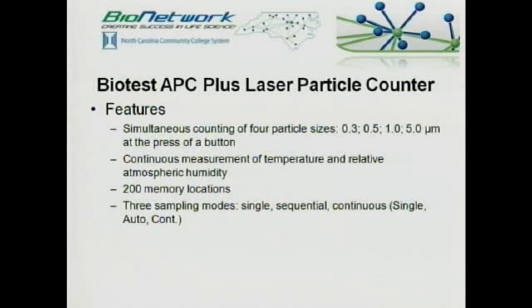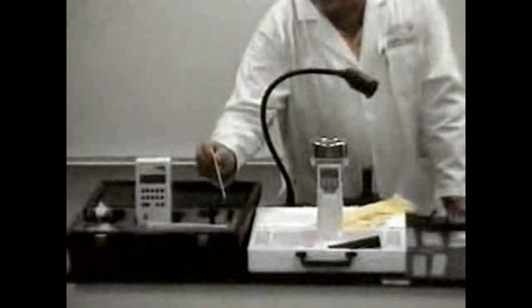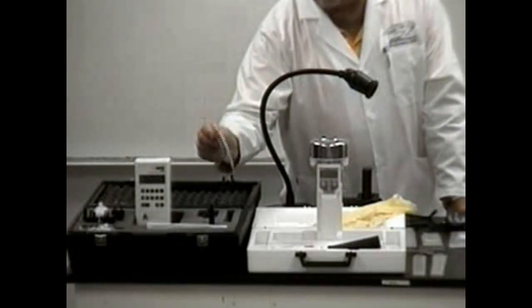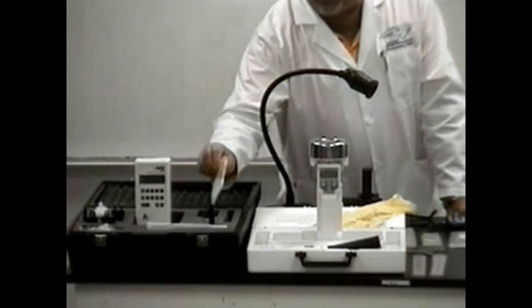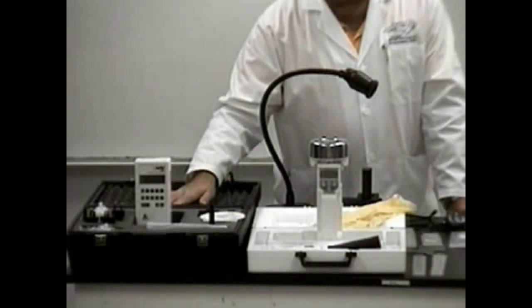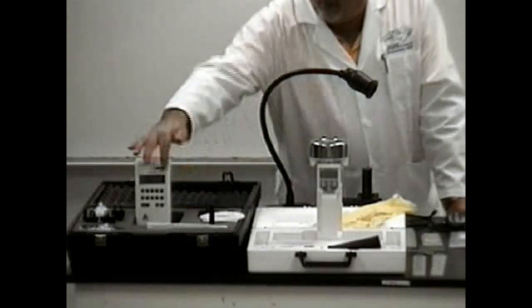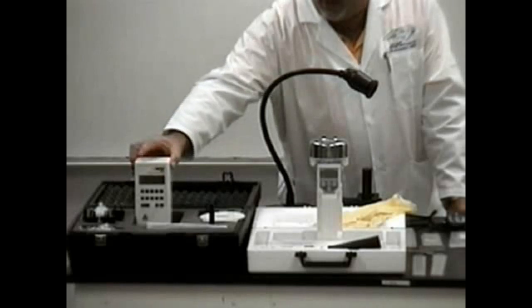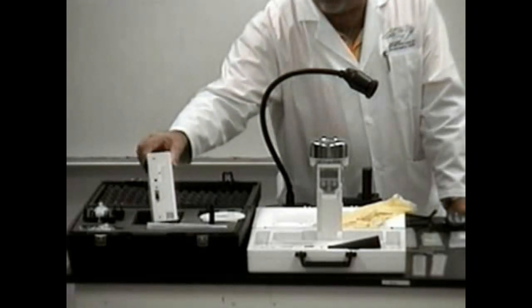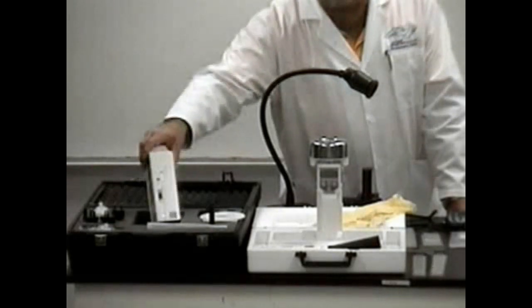Let's first look at the Biotest APC Plus laser particle counter. It actually has a padded carrying case that is easily opened and contains all the accessories necessary for this instrument, including the software used to download data onto a PC. The instrument itself has an LED screen and easy-touch buttons, and on the side there is an RS-232 cable provided by the manufacturer.